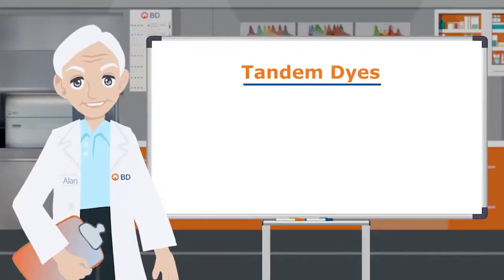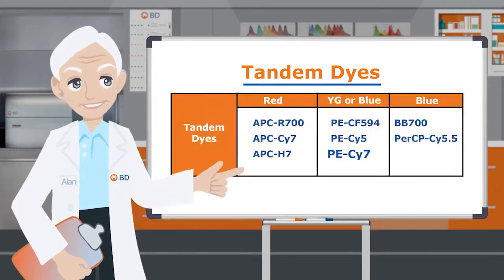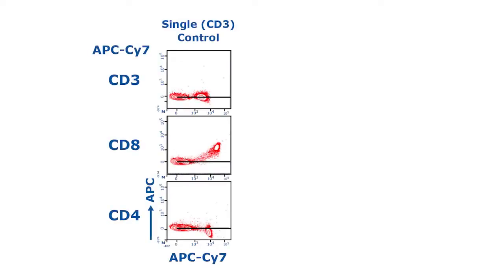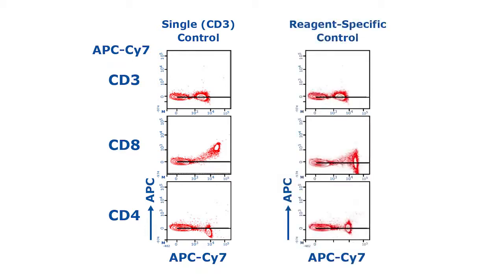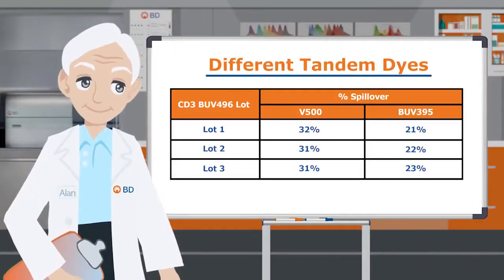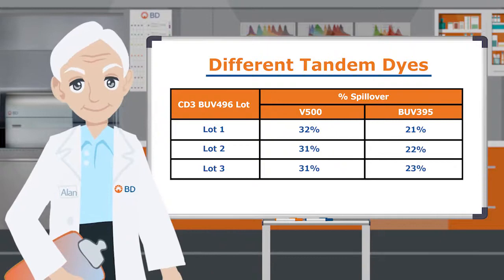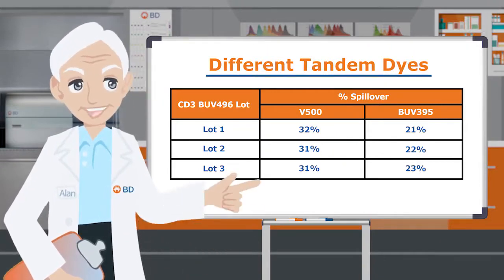The second related principle pertains to tandem dyes, such as PE-Cy7 and APC-Cy7, for which spillover properties may change when the same tandem dye is conjugated to different markers. In this example, the spillover values calculated using the CD3 APC-Cy7 single stain control are not accurate for the CD8 or CD4 APC-Cy7. In these cases, it is important to use reagent-specific compensation controls as shown in the right column. Similarly, when different lots of the tandem dye are conjugated to the same marker, you can also have different spillover values. In these cases, lot-specific controls should be used to accurately calculate compensation.